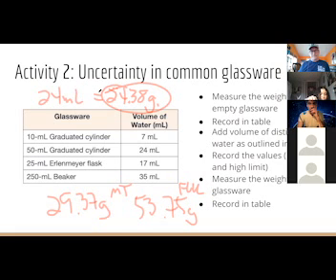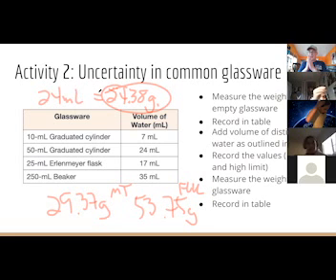That measurement? Outlier? An outlier, excellent. Yeah, so we avoid using outliers because basically it means we did one of those things wrong. We don't know, I might have done something wrong. The chemical I used was wrong, something was wrong. But if we include that in our calculations, it screws up our calculations. All of the errors become bigger because of that one thing. Well, if we can figure out that that one thing is screwed up, we get rid of it and our errors shrink and we get closer to the actual answer.